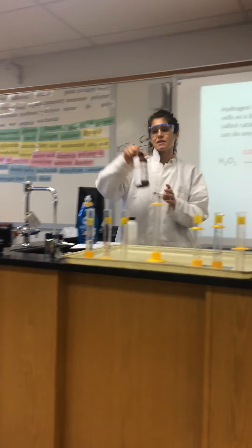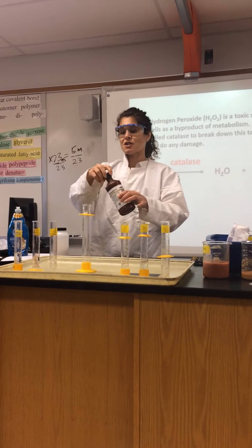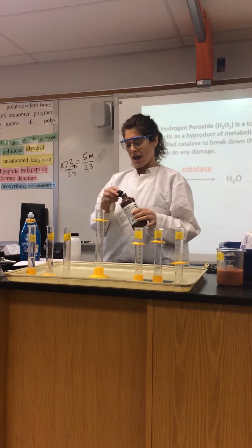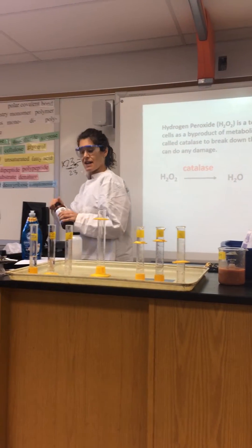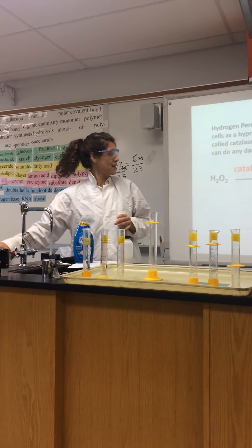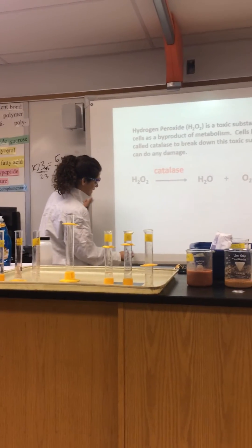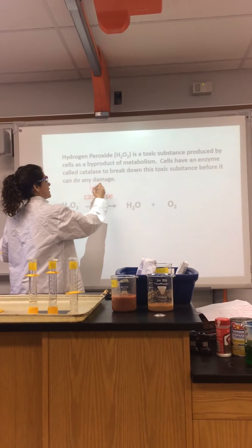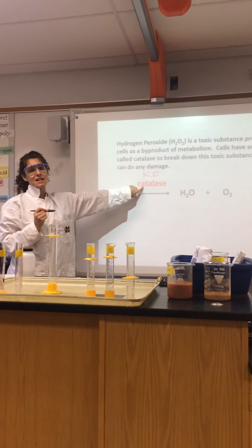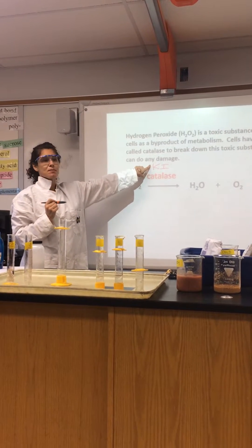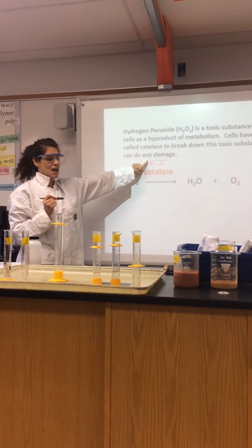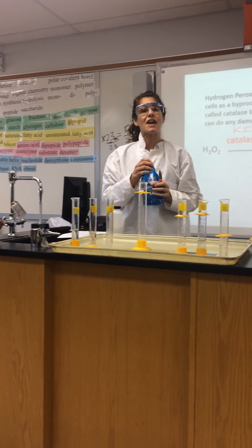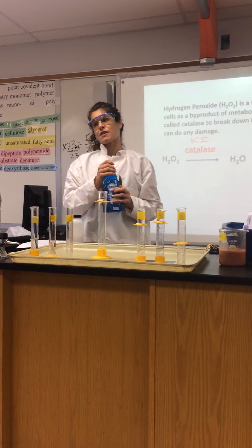I'm going to put some hydrogen peroxide — this is 30% — into a graduated cylinder, and I'm going to put in an inorganic catalyst called potassium iodide, which has a formula of KI. We're going to be doing a demo with catalase, which is an organic compound, but potassium iodide has no carbon, so it's an inorganic compound. I'm going to show you an inorganic catalyst first, breaking down hydrogen peroxide into its two products: water and oxygen.